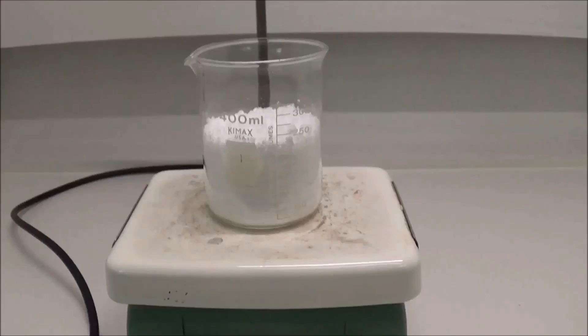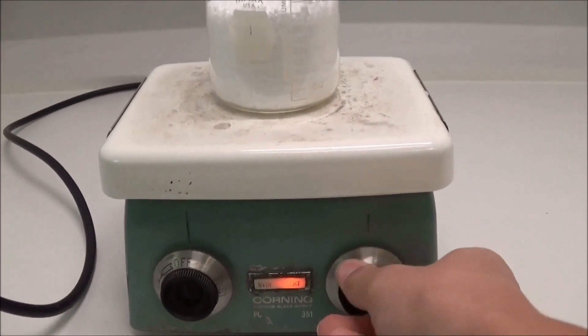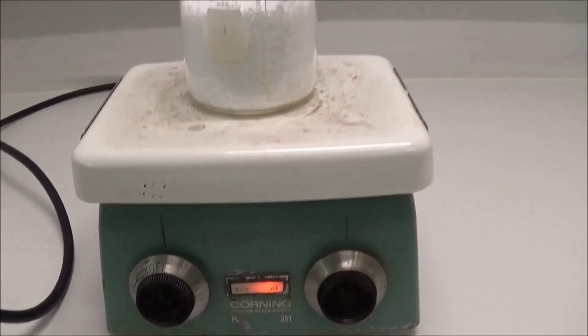The beaker seen here contains approximately 60 grams of phthalic acid. It's placed on a hot plate and the hot plate is turned on to medium-high heat.